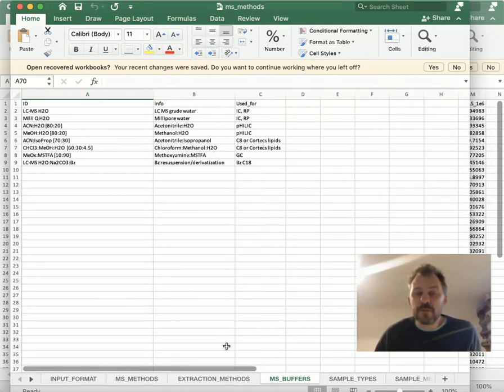There's a little bit of a problem with the syncing, that I think if you download a new version, then it will overwrite this file. So if you want something new to be permanent, a new method, then you have to email it to me and I'll put it into the master version.